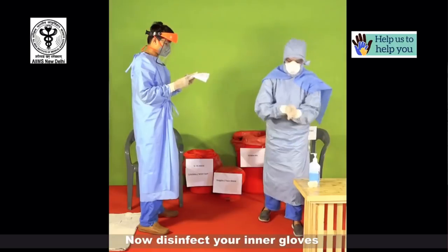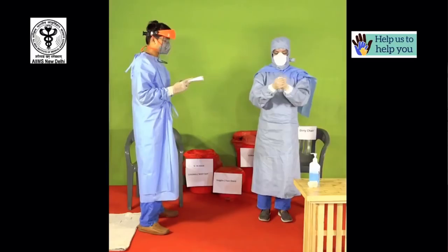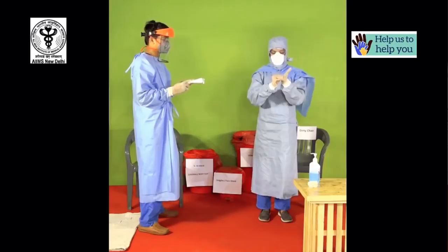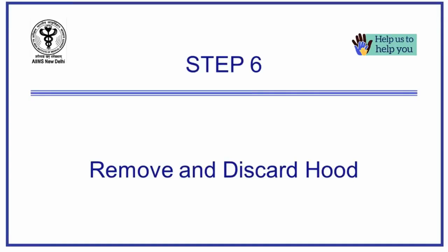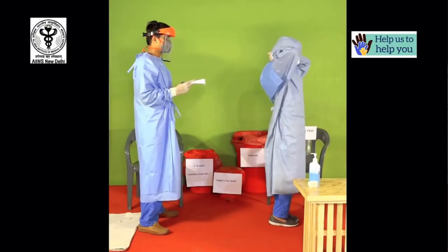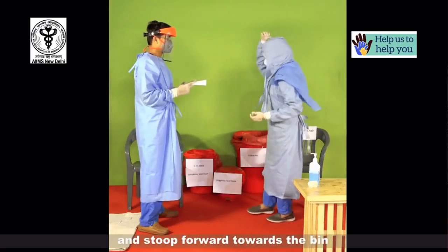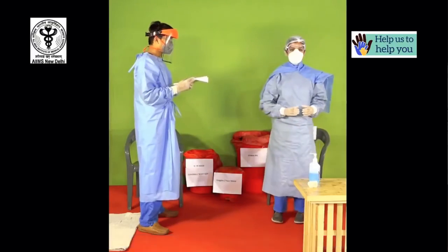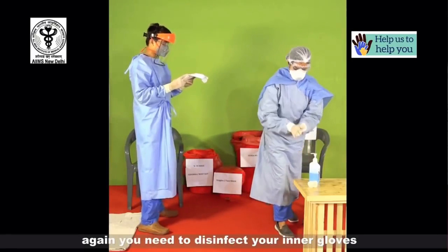Discard them in the red bin. Now disinfect your inner gloves. To remove the hood, open the ties from behind the neck and stoop forward towards the bin. Pull out the hood from the top and discard. Again you need to disinfect your inner gloves.